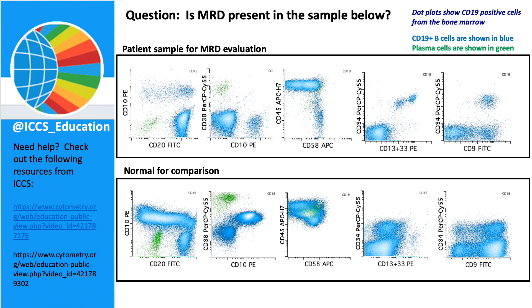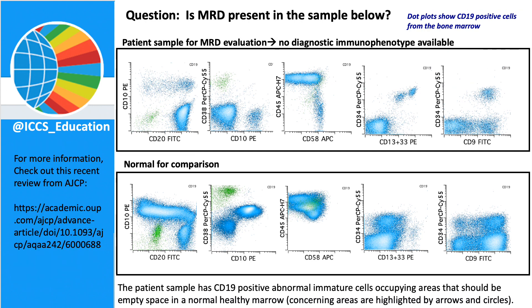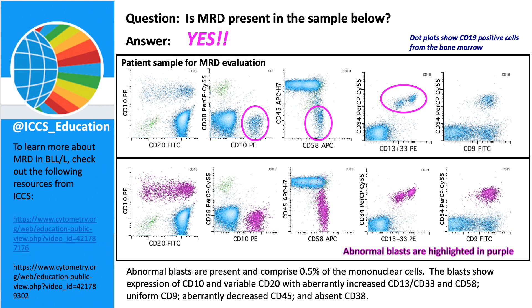Welcome back from your pause. I suspect you have identified something a little funny in this patient sample. We see some areas occupied by cells that are really empty in the normal sample for comparison. Highlighted by purple circles, we have a few positions in the patient sample where the normal sample is relatively empty, which are quite concerning for residual disease. We can draw a gate around these populations and indeed confirm that yes, this is an abnormal blast population and this patient unfortunately does have residual disease present — they are MRD positive.